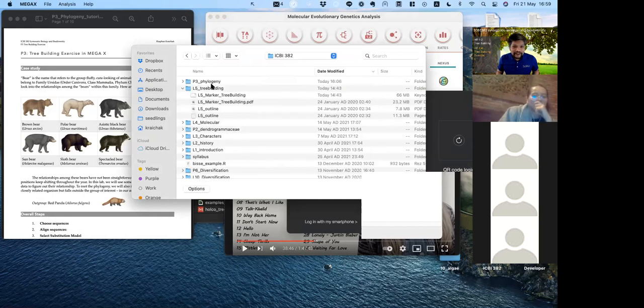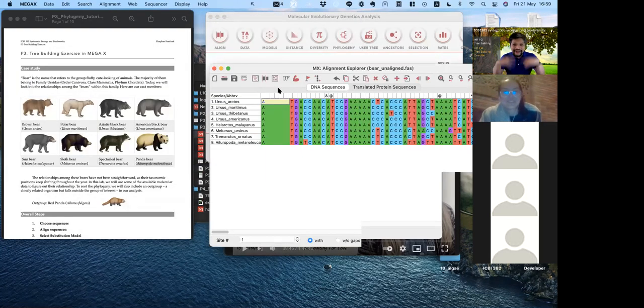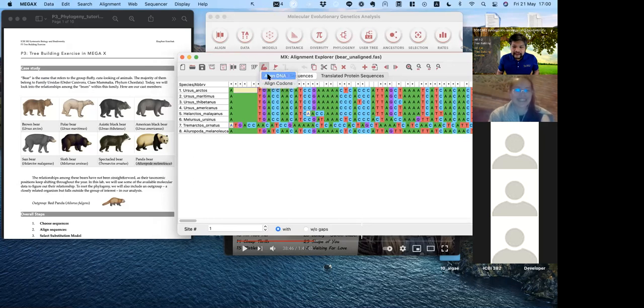This could be one of those things where, here it's done, bing, it just magically happened. Here we go. See, I get all eight sequences in there, done. Actually, I forgot the red panda, but that's okay. Is it okay? It's not okay. Okay, so I'm going to press Control A if it allows me. Oh my God, the program went crazy today. Align the DNA.